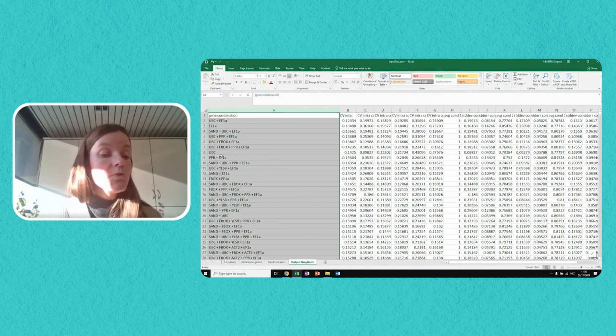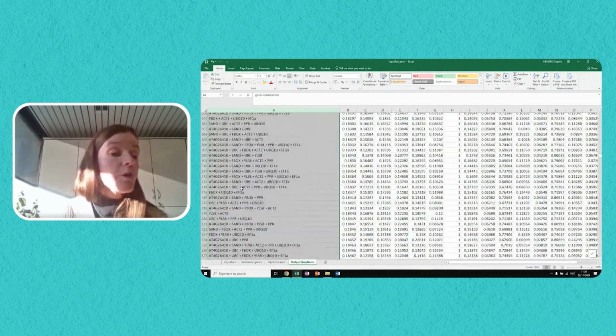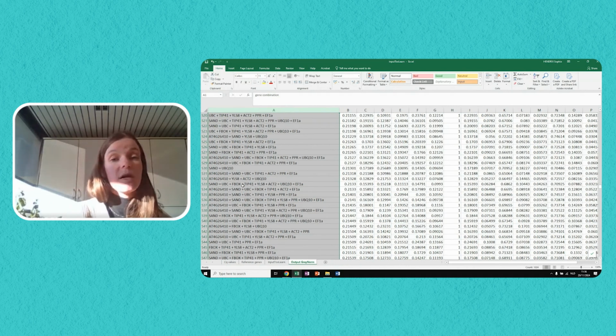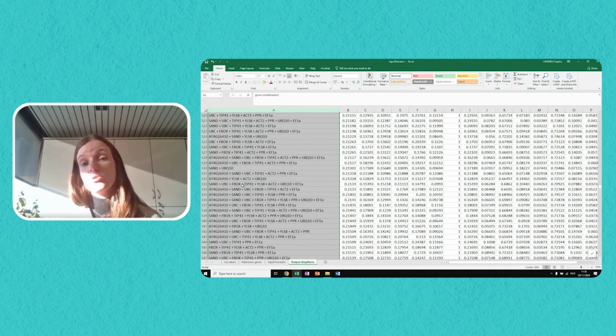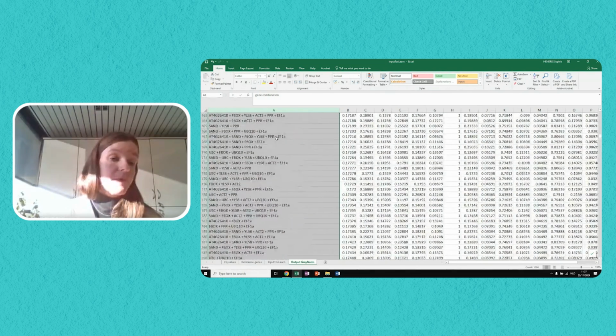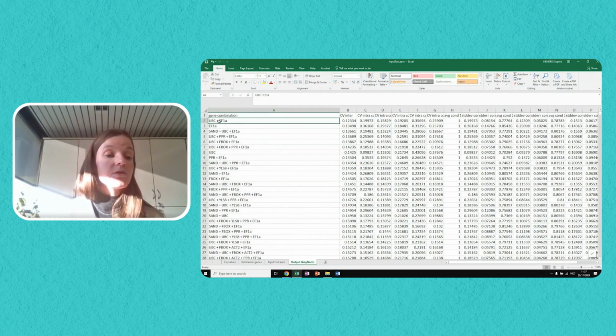And the first column, you can see all possible combinations of reference genes. There are, of course, a lot of possible combinations because we measure a total of 10 reference genes, and it will test any possible combination of these 10. So it will test each of the 10 individually, all 10 reference genes together in one combination, all possible combinations of 2 genes, 3 genes, and so on. And it will rank them based on which genes are most appropriate to use for data normalization. And the ones at the top are the best to use. The ones at the bottom are the worst combination to use.